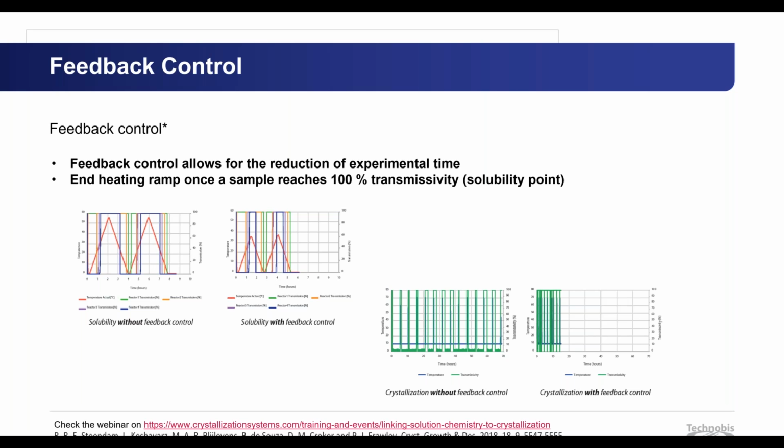And related to these, and related to a webinar that I think last year was presented by René Steindam for us. He did quite some work on, of course, induction time measurement by using the feedback control feature of the software of the Crystal16, where this feedback control feature helps a lot on optimizing your experiment.